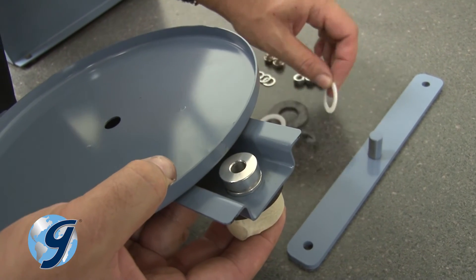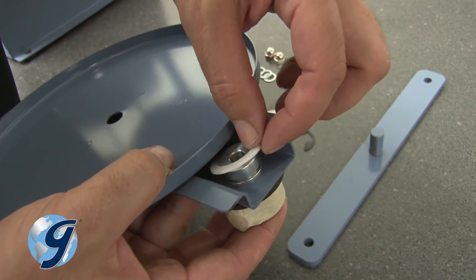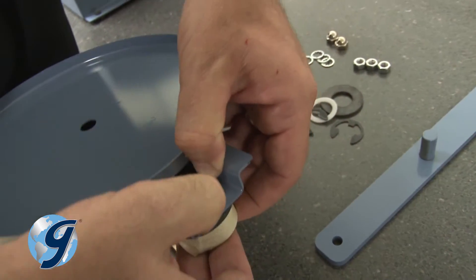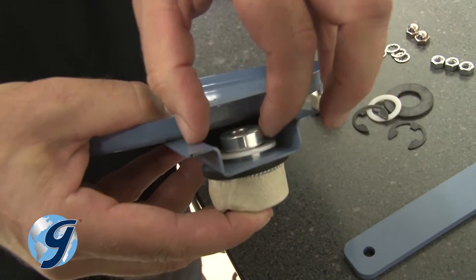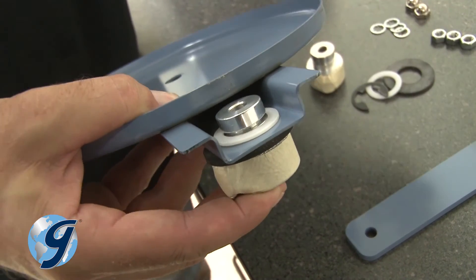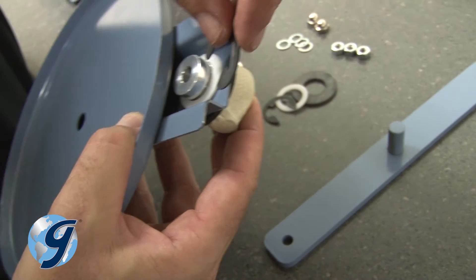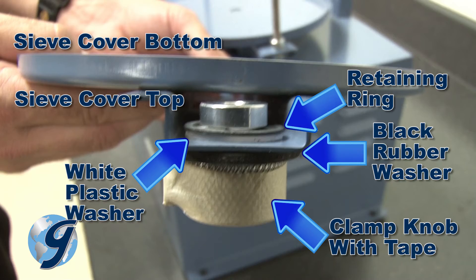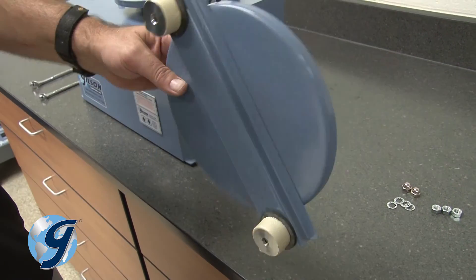Next, place an Easy Clamp plastic washer on the underside of the Easy Clamp knob and place it against the underside of the sieve cover. Now push a clamp retaining ring onto the groove of the Easy Clamp knob until it seats completely within the groove. Repeat the steps for the other Easy Clamp knob.